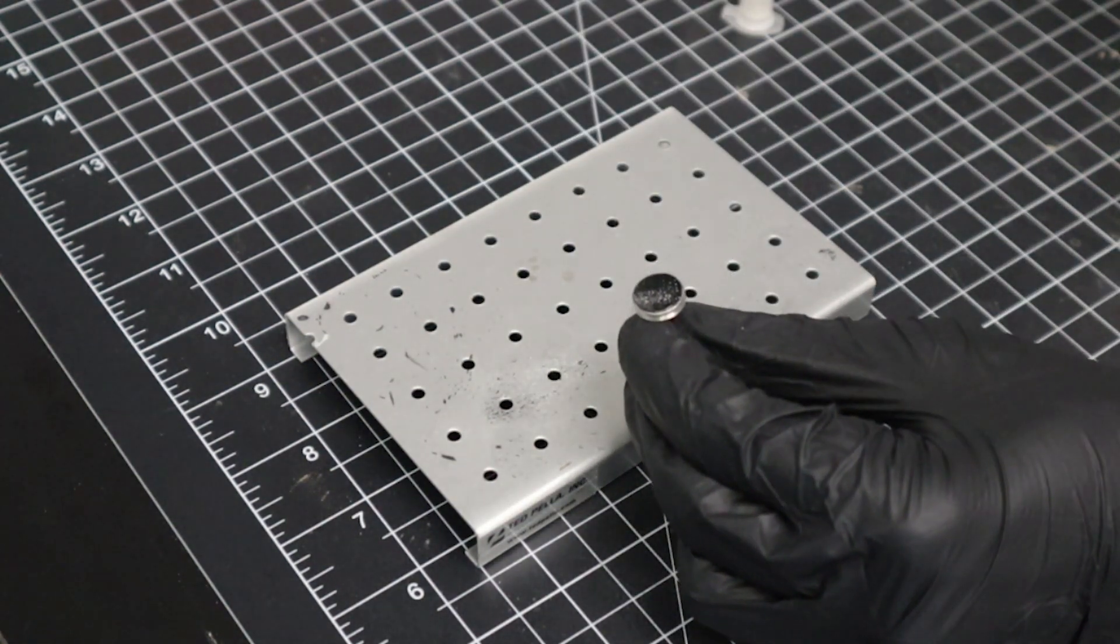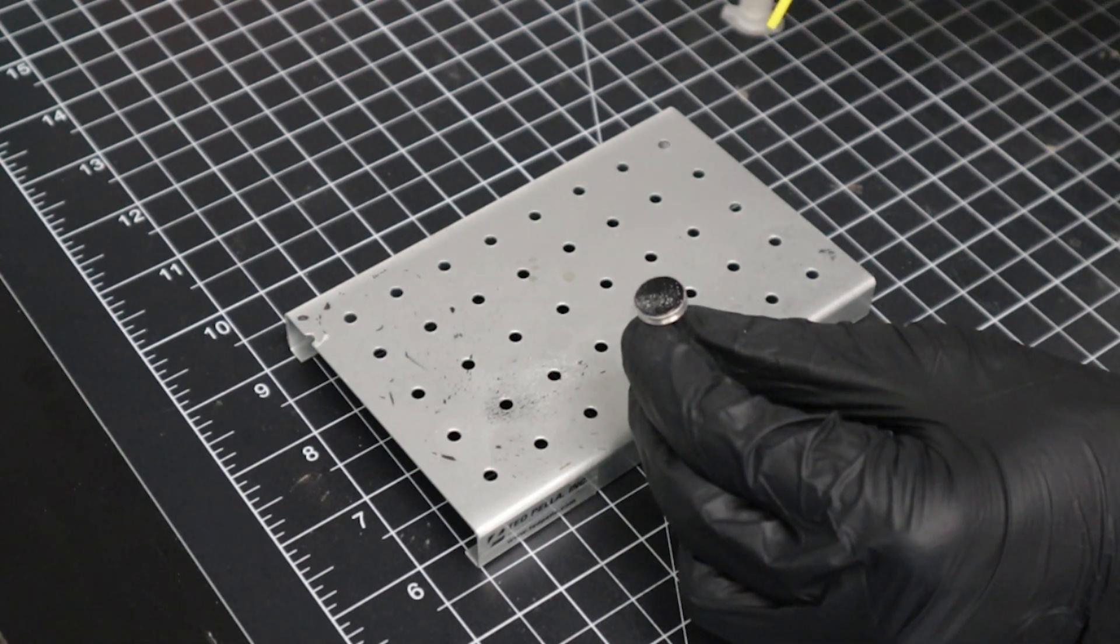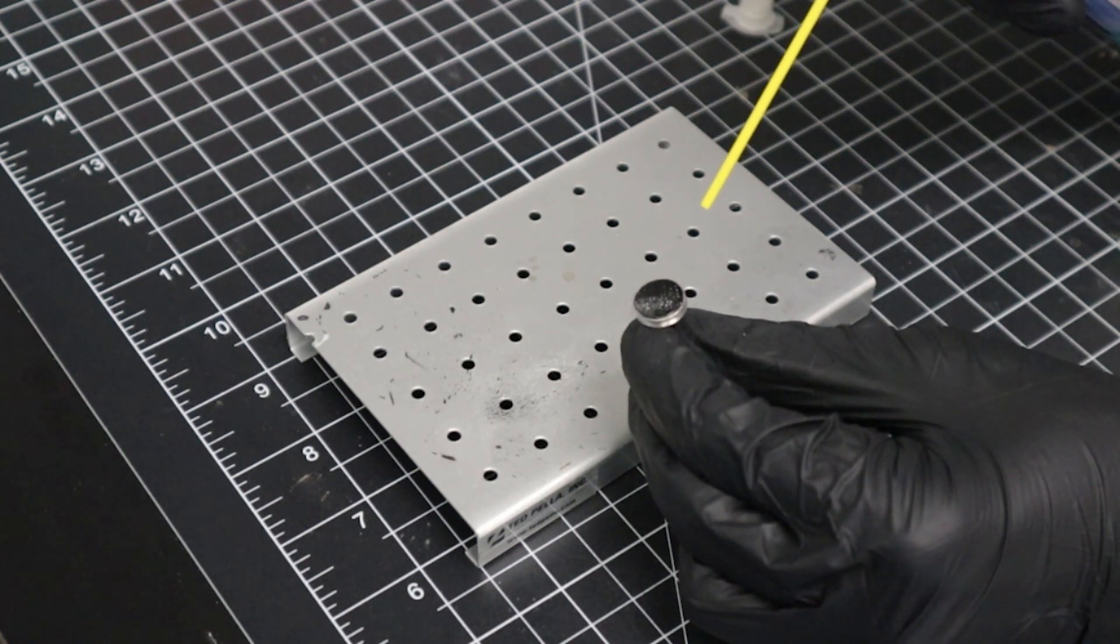To finish the preparation, we remove any loose particles from the stub by blasting it with a canister of compressed air.